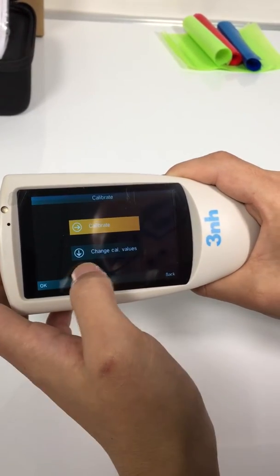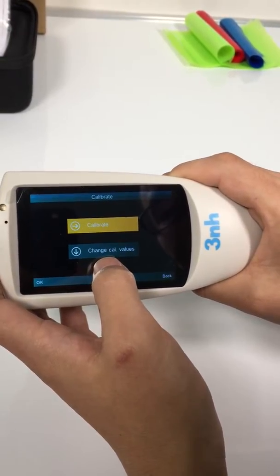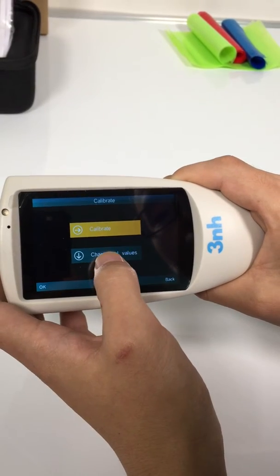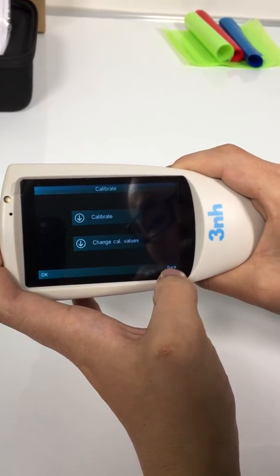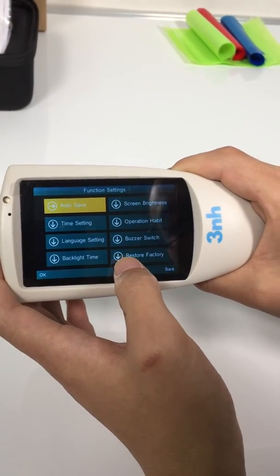Calibrate — do calibration here, and if you need to change the calibration board, you need to do it here to change the calibration value. Setting — these are the general system settings.